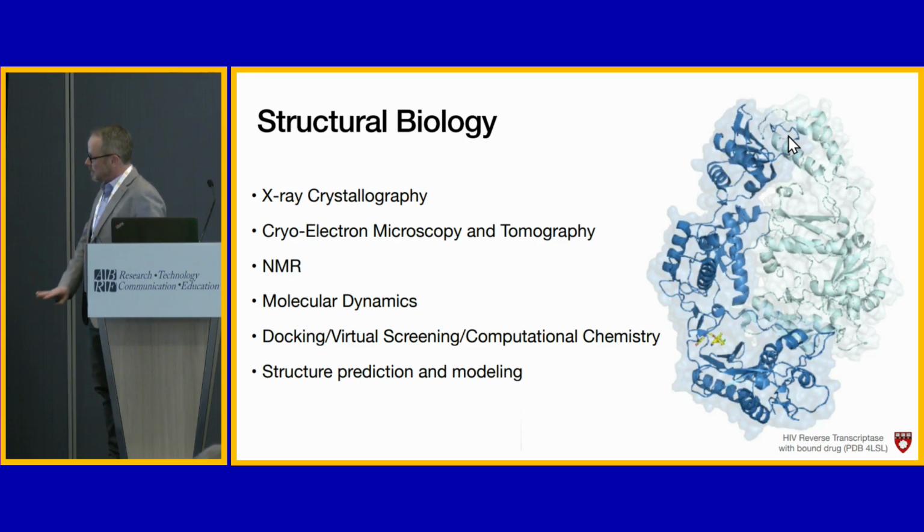We count that within structural biology, as you're using molecular models to make conclusions about what would bind or what wouldn't bind. And this is the next big thing by hot software titles: structural prediction and modeling, right? So this started with AlphaFold, and these tools just keep coming.